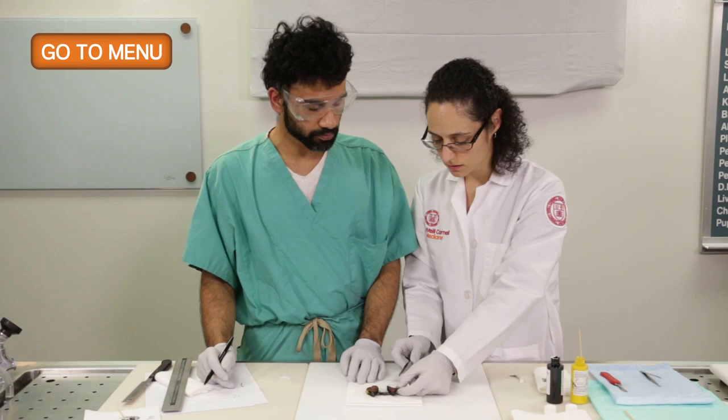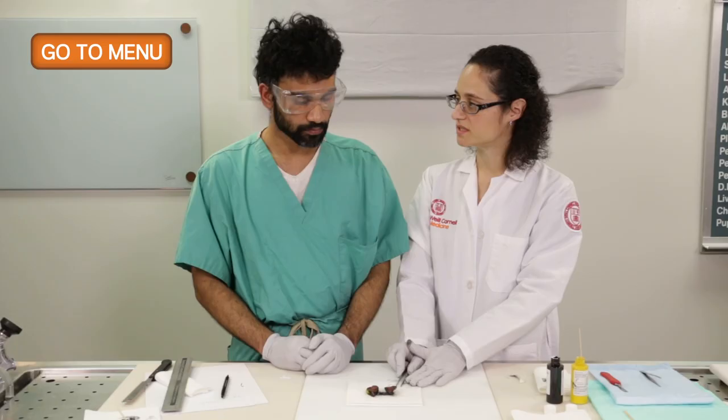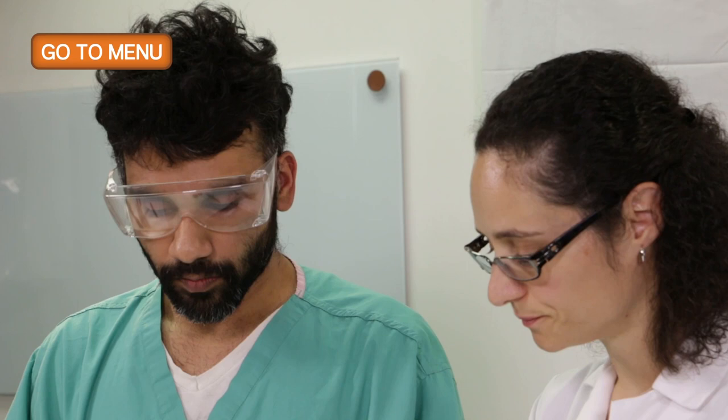So we've now cut the specimen coronally. We've identified the lesion and described it. Now, what do you want to do next? Well, I guess the next thing is to figure out what sections you want to take. Right. So for a single, solitary, non-encapsulated lesion that you have in the thyroid, how many sections do you want to take?